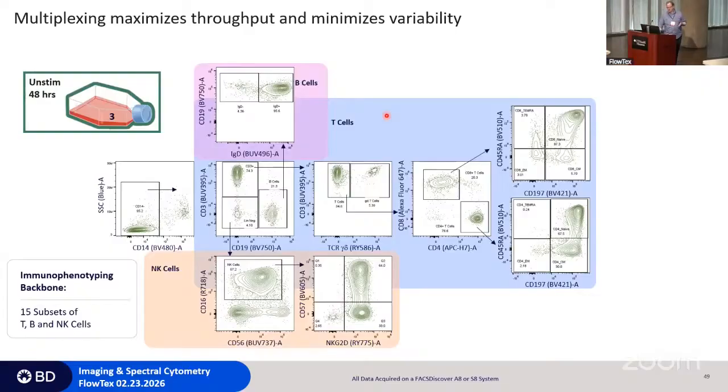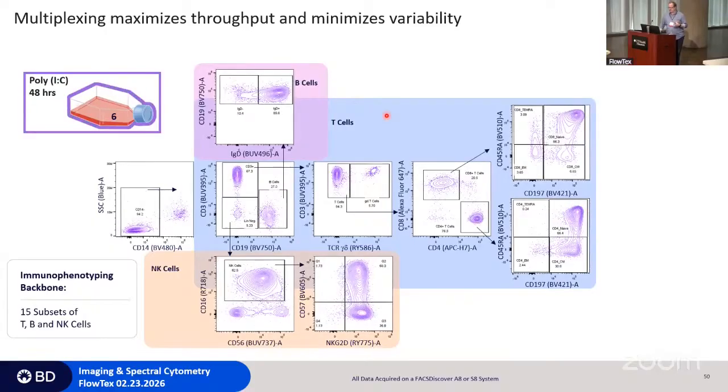But as you go through these, what I found was that I hadn't had any experience with poly-IC before. Poly-IC is apparently a really fast-acting thing, and so I missed most of the poly-IC activation. I did catch a little bit, so it was mostly focused on the CD3, CD28. And there was some panel optimization for this too.